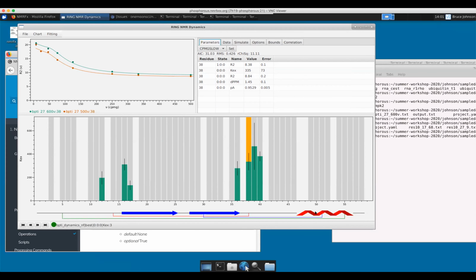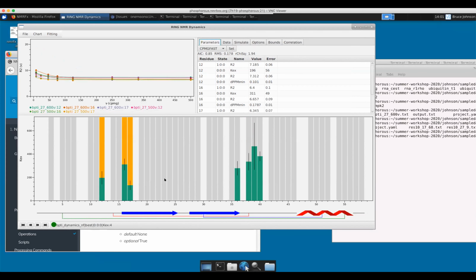Now we've got a plot of basically sheet and helix, and these lines interconnect disulfide bonds. You can see there's a group of residues that exchange at each end of this red line for this disulfide. So presumably that's a disulfide bond isomerization, and the exchange is happening with the same exchange rate, we presume.